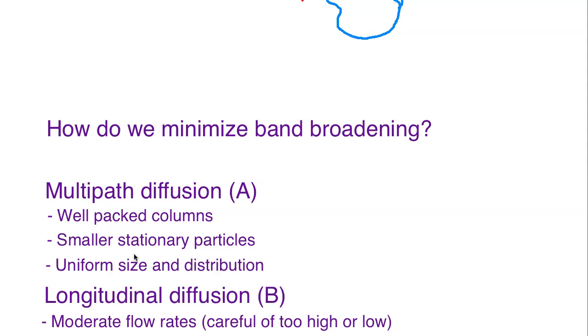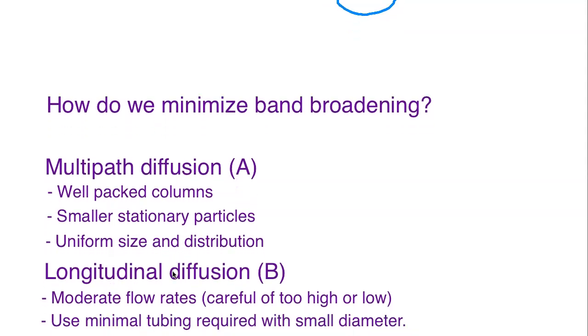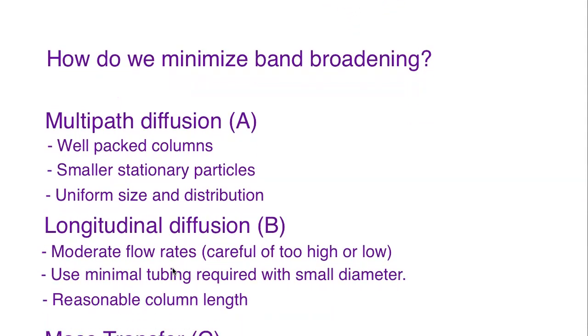And there's a discussion about stationary phase size, what's relatively considered acceptable, when you could run into pressure issues, things like that. Okay, and then the other thing you want to make sure is you definitely want uniform size and distribution of the particles that are making up the stationary phase. So again, you're kind of at the mercy of the column producer, okay, but obviously taking good care of your columns plays into this in terms of making sure they continue to stay well packed and that the distribution is good.